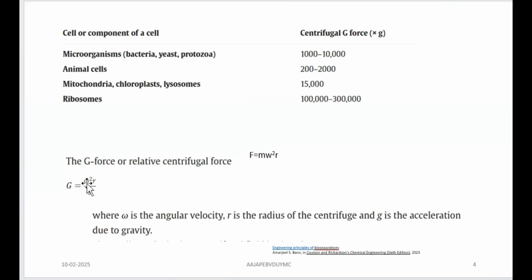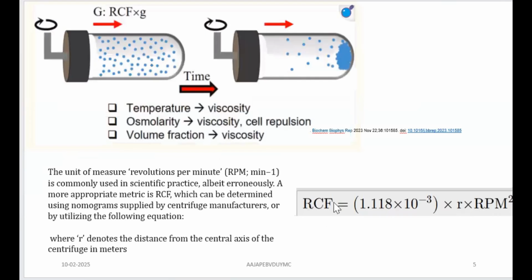So this is the relationship for a particle which is spherical. And then if you substitute these values, you get this particular formula. All right. So it is with reference to considering a particle under centrifugation as circular. So you bring into the equation the symbol pi, then pi into RPM upon 30 is equal to omega.